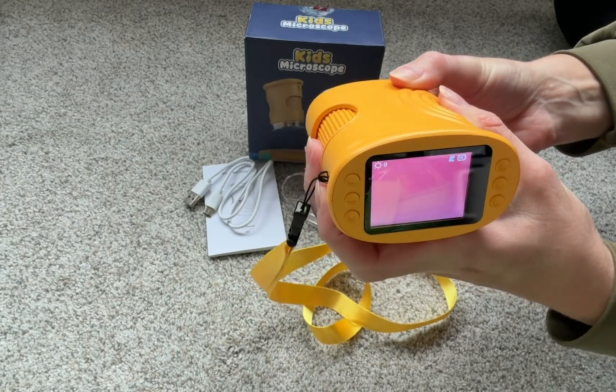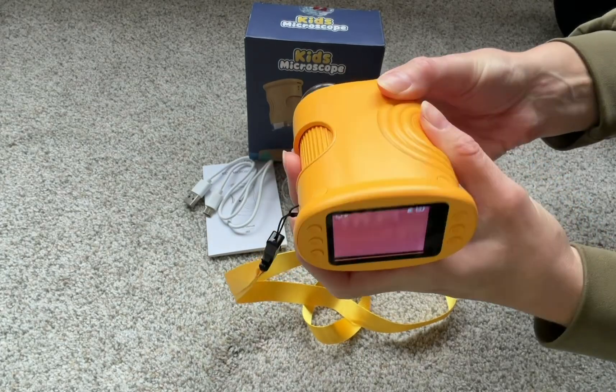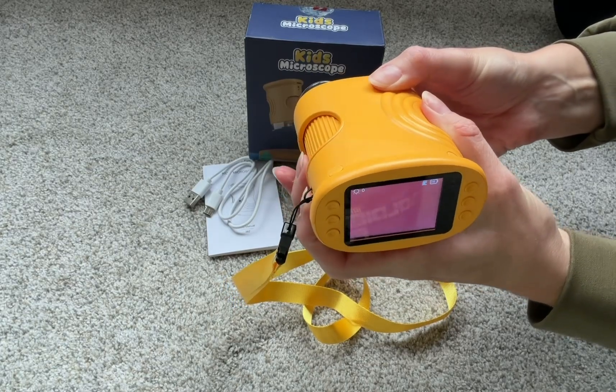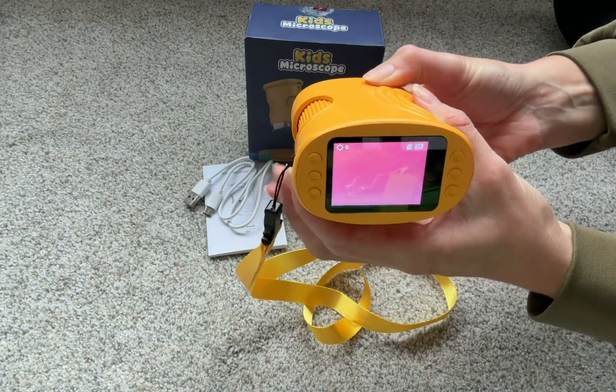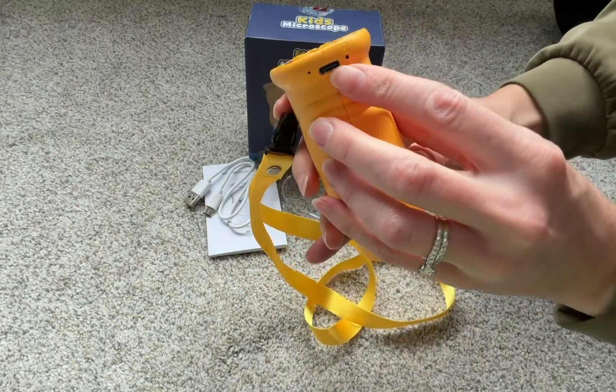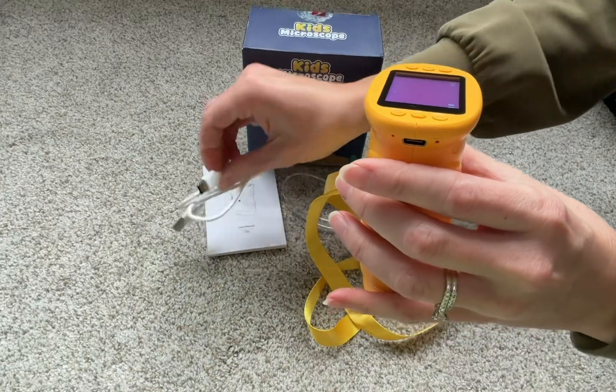To adjust the zoom and focus the picture, you can slide this right here — it will go between 200 times magnification to 1,000 times. It's definitely a really nice, powerful magnifier. Over here you're going to see there is a USB-C charging cord.